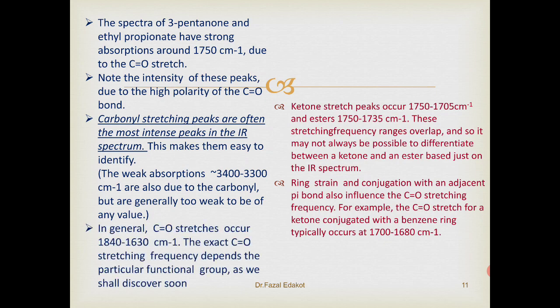In general, CO stretches occur at 1840 to 1630 per centimeter. The exact CO stretching frequency depends on the particular functional group, as we shall discover soon.